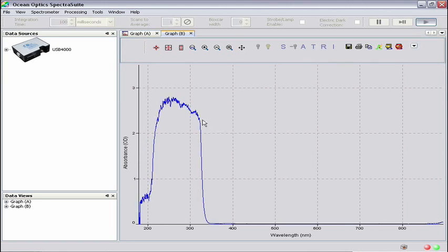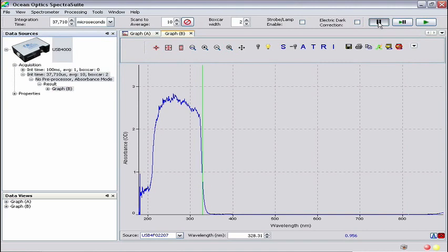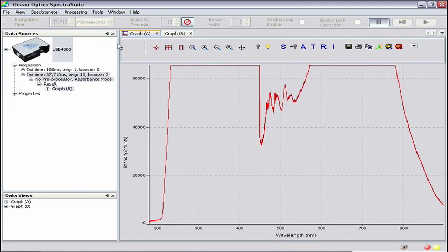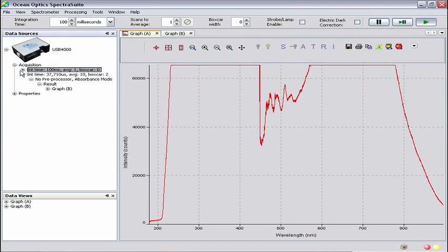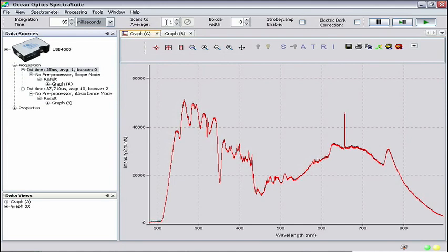We'll pause the experiment here so we can show you how to make an absorbance measurement without using the absorbance wizard. Click the Pause Selected Acquisition button in the Acquisition Controls toolbar. You may have to click the graph to activate these controls. We're now ready for our second method. Click on the Graph A tab in the Graph pane. Now click Acquisition Parameters in the Data Sources pane. This will ensure that we are adjusting the acquisition parameters for Graph A and activating the Acquisition and Acquisition Controls toolbars. In the Acquisition toolbar, set integration time to 35 milliseconds.